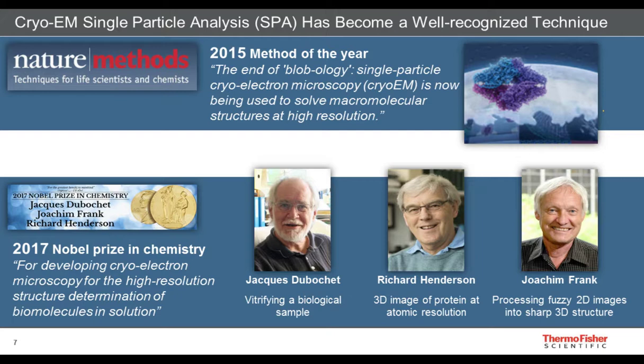And at the end of last year, I should say, the Nobel Prize for Chemistry was awarded for the pioneers in cryo electron microscopy, being Jacques Dubochet, who mainly focused on sample preparation, and I will talk about it a little bit more in the next couple of slides.